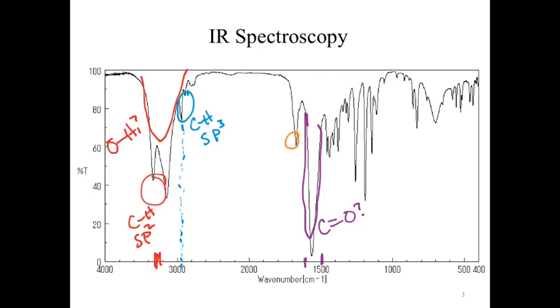This peak looks a bit interesting, particularly because it's coming at a greater value than the carbonyl. That's sitting at maybe 1700. Kind of hard to tell exactly, but it looks like about 1700, which could be a carbonyl, but again, the intensity is way, way, way off. So with this IR, you notice I've got a lot of question marks. It's not particularly helpful, but that's fine. That is what it is.